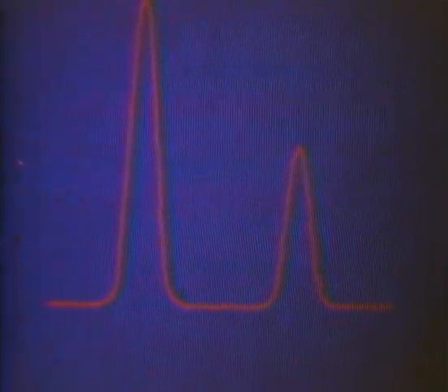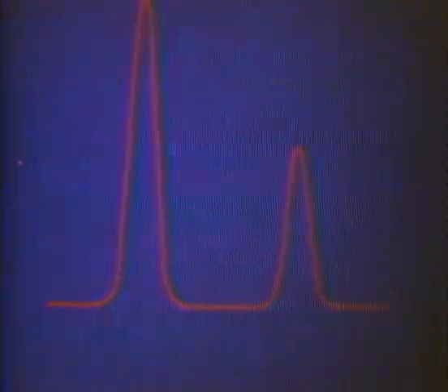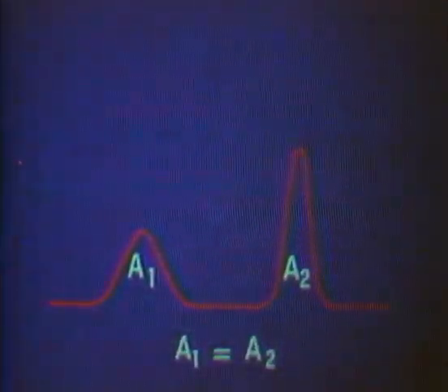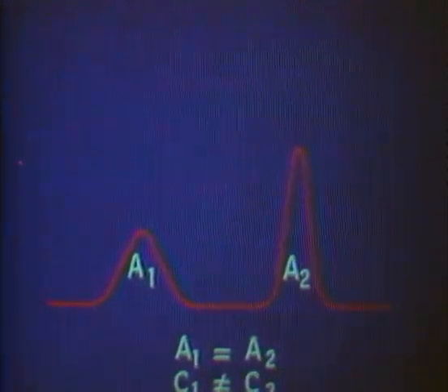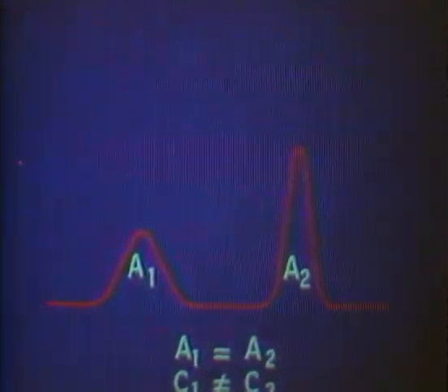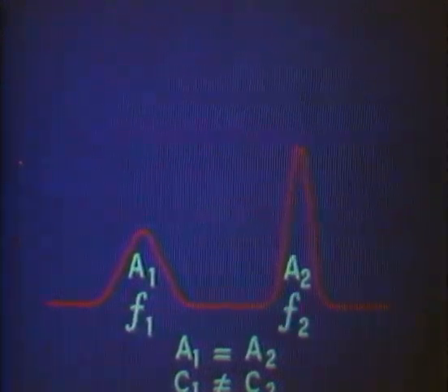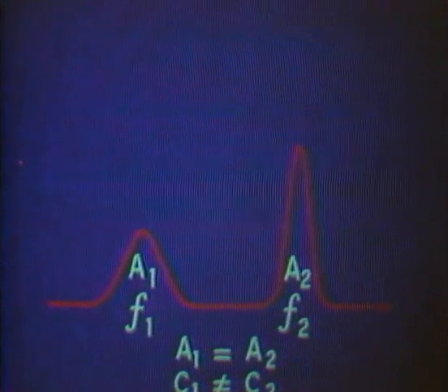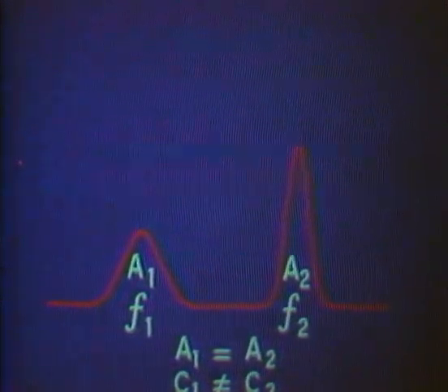However, since the detector does not respond identically to equal amounts of different substances, equal areas of two substances do not mean equal concentrations. If accurate quantitative results are required, individual calibration factors must be used for each peak. These calibration factors depend on the type of detector used.